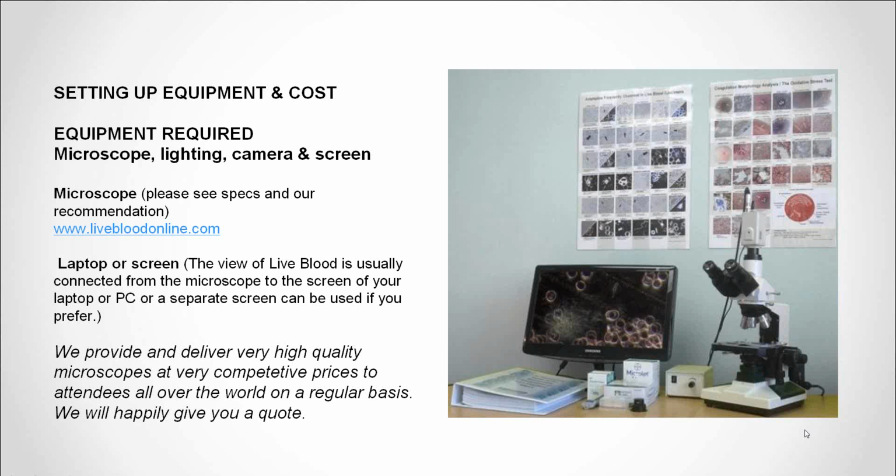Do you have anything to add to that, Dr. Ocker? Not really, just that it really boils down to practice, taking samples and spending time behind the microscope, and the more you practice, the more proficient you become at it, and that's the most important thing, is practice.